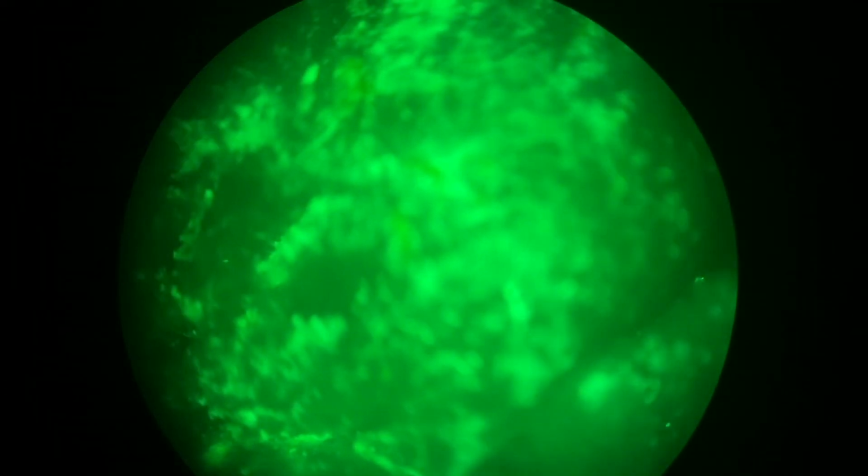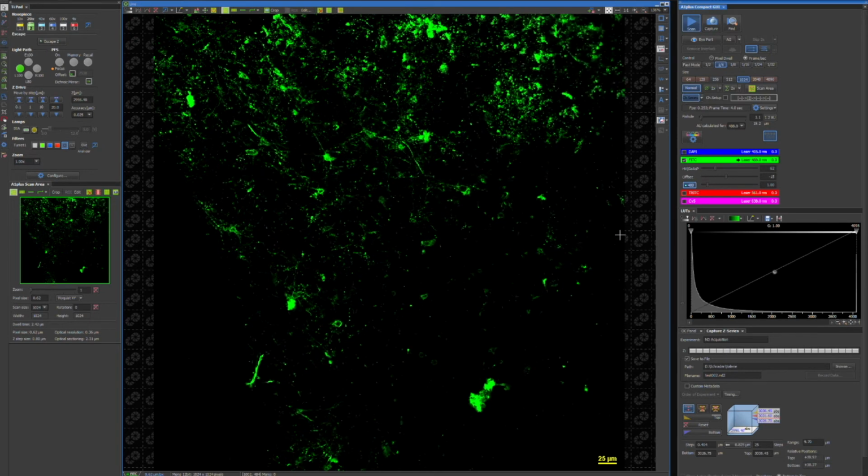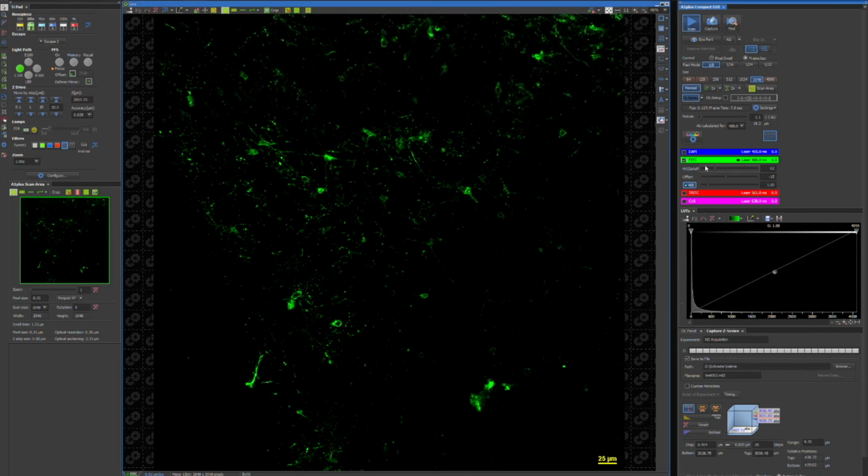When I scrolled across this, my hope for this round was completely restored. I can see that there's so much going on, and I literally ran to the confocal to take a better look. So there's a lot of noise, but these are definitely neurons. The larger clumps are cell bodies, and the thinner lines are the dendrites coming off of them.